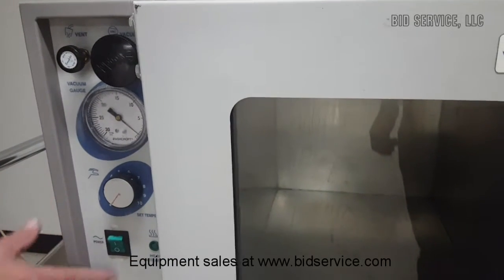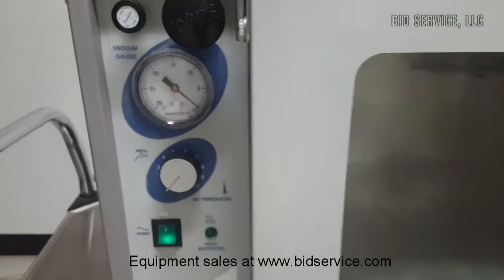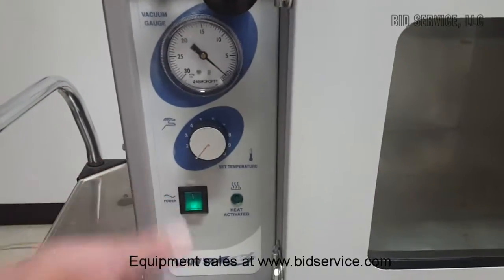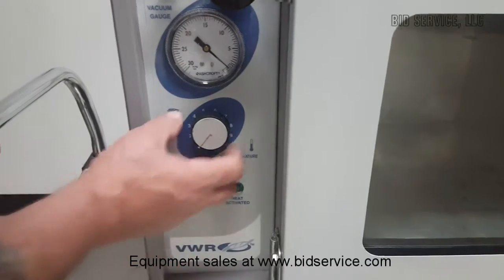The main power for the unit is here — standard 110V. Turn it on to get a pilot light, and here's your heat indicator.